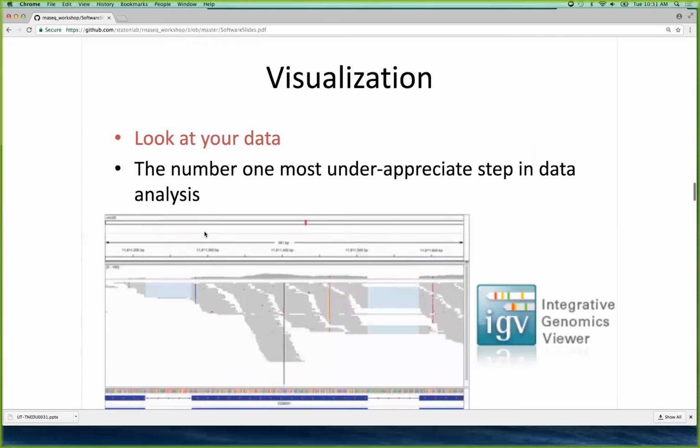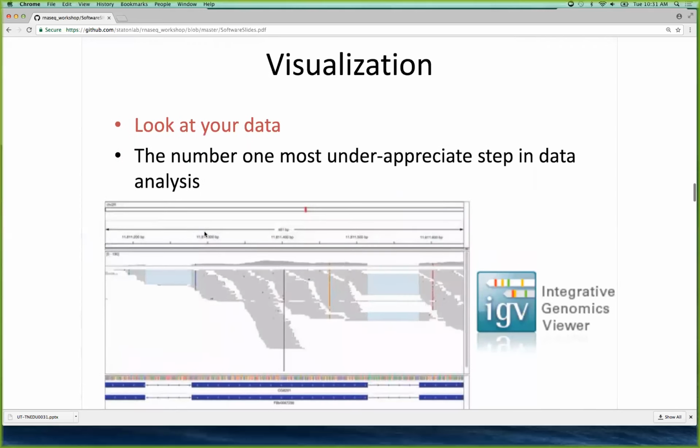And then the step that I was also saying, visualization. It is not usually a lot known, but it is very useful for you to know how your reads are distributed throughout the gene model that you provide.